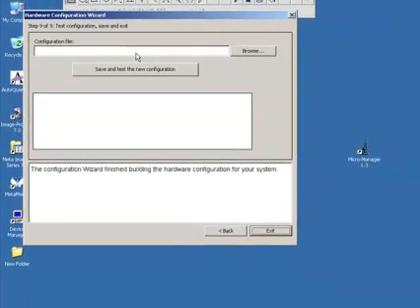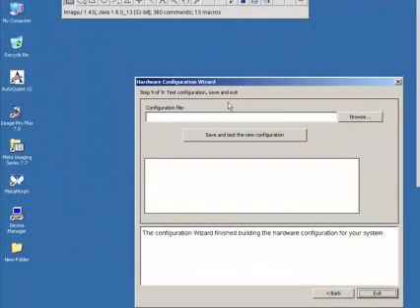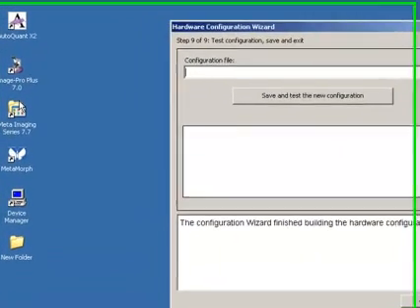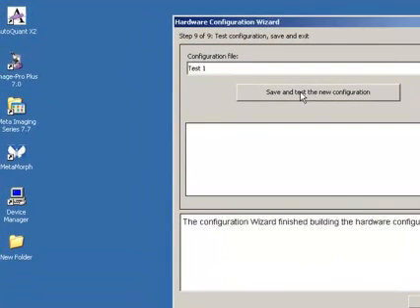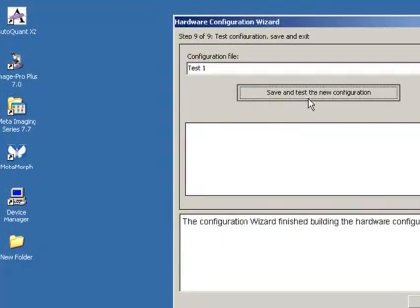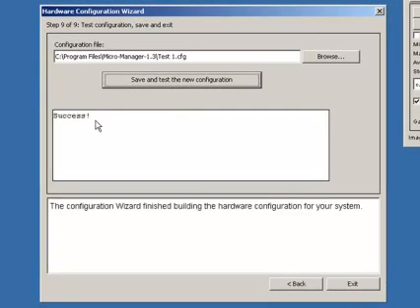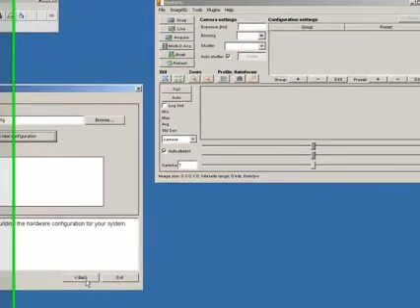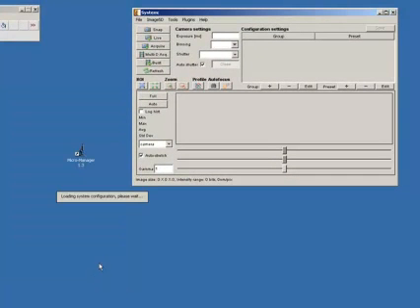So, you work away through the menus and you get the final one here where it's going to test and save it. So, let's just give it a name and we're going to call this one test one and save and test. And hopefully, it'll spin the filter wheel and open and close the shutter and it'll tell us everything's been installed correctly. So, it says success here. If there's any problems it'll come up and tell you where the problem is and you can work your way back through the menus and correct as you need to.